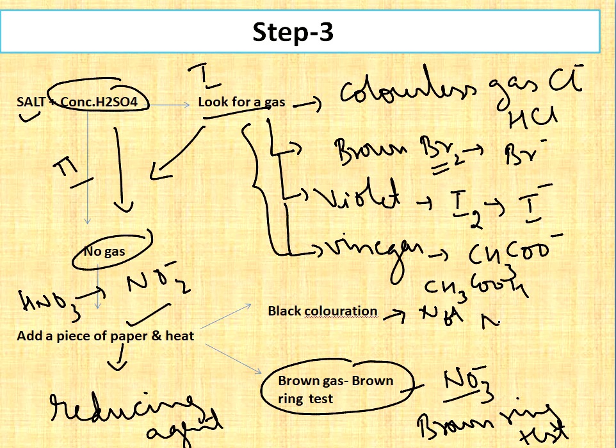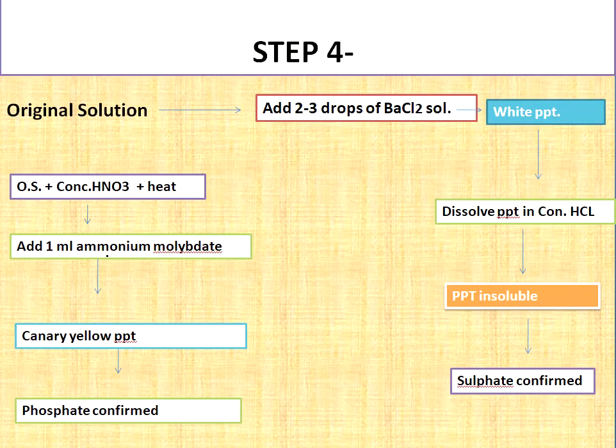Next, if black coloration is observed, then it will be not nitrate. Nitrate is not there, maybe another is present. This is the third step. Next, we are moving to the fourth step.